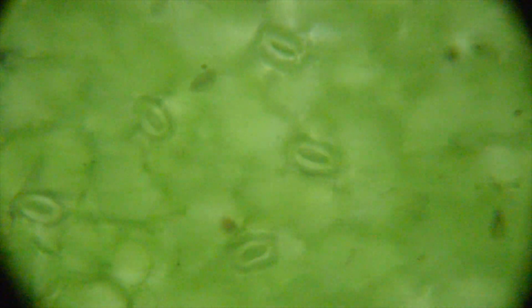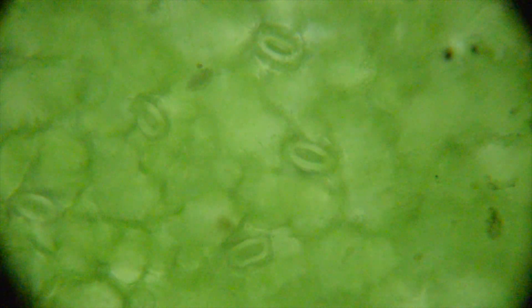Let's look a little bit closer now. We're going to look at it about 100 times and you can really easily see the guard cells of the stomata. The stomata can vary in size and some of them can be more open or more closed, and they actually close and open depending on various environmental factors.